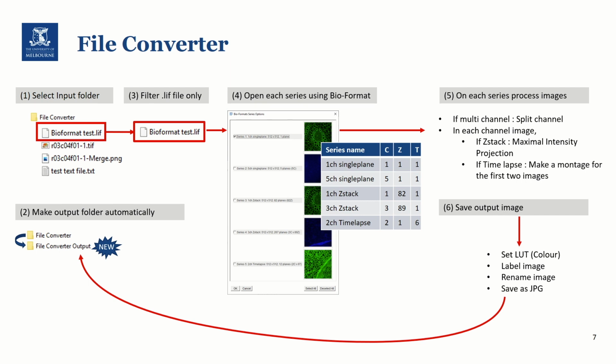In this workflow, as you can see, I have added many components in one script to show you what is possible, and hopefully you can grab some segments out of this and utilize them in your own script in the future.